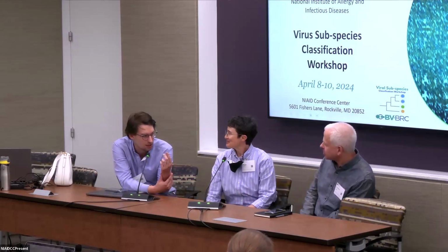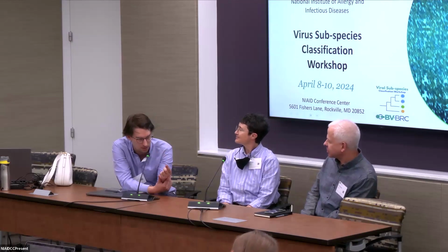I remember you sometimes ask, where should I draw the line when it wasn't so clear? Luckily, it doesn't happen very often. But at MPOX, we do it redundantly. We have reference sequences and we annotate mutations that are defining, because that gives you some resilience. Yes, from the tree perspective, I do need a set of mutations that are defining.